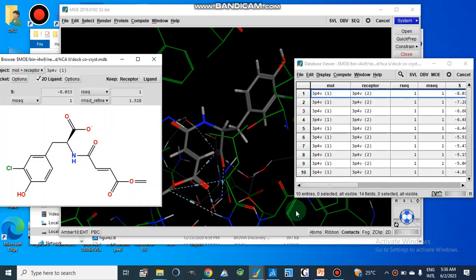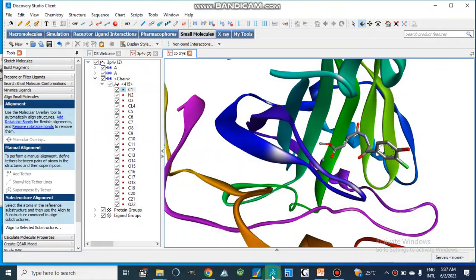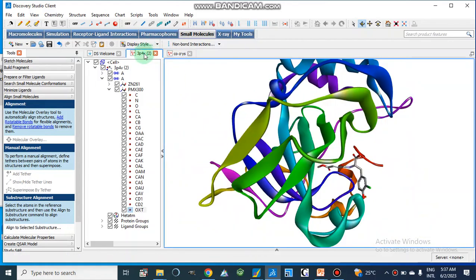Assalamualaikum, dear viewers. Today we will discuss how we can find or calculate the RMSD value — that is the root mean squared deviation value. For this purpose, first of all we should have a crystal structure of an enzyme-ligand target complex, or enzyme-inhibitor complex, and we can retrieve such structures from the PDB.